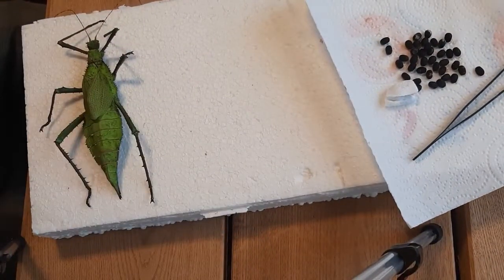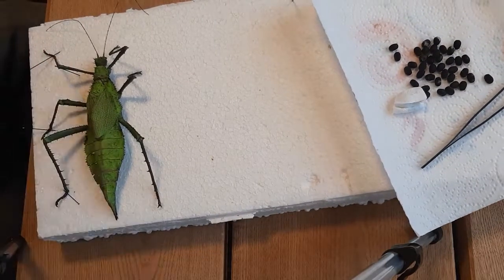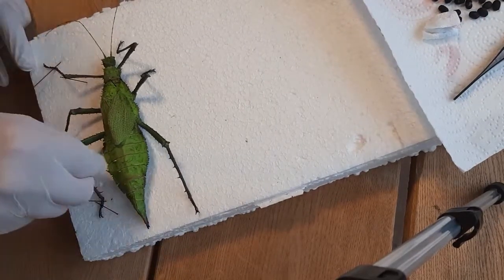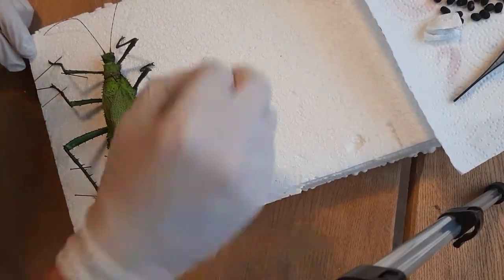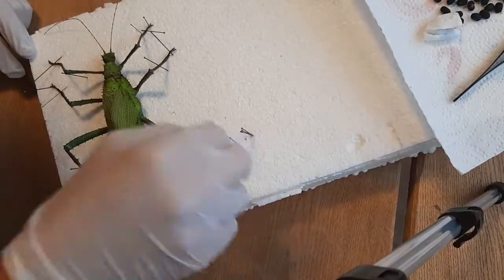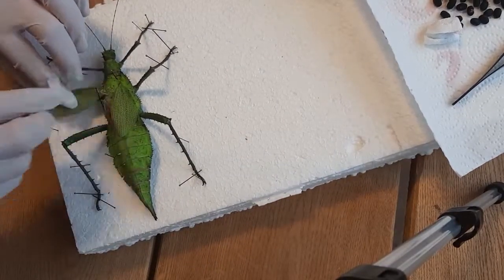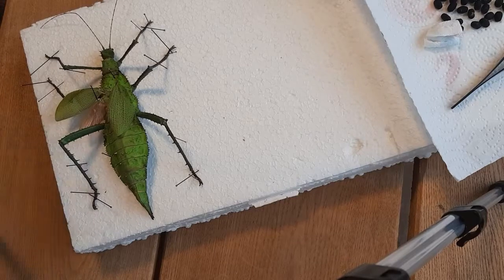You put a needle through the thorax — this is where you will grab it once the stick insect is dried. For a big one like this you can handle it, but for thin and small ones they might damage if you don't have a needle inside the body to grab instead of the body itself. Then simply place the legs the way you want them. You can have them looking natural, like they are walking, or mounted the way they look prettiest. My method for unity in the collection is to have the two upper pairs of legs pointed forward and the back legs pointed backwards, though you can also point the middle pair backwards, or use a walking motion. You can even mount them on a piece of wood to look natural.